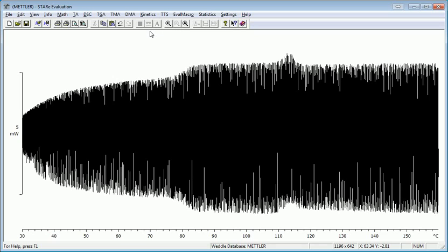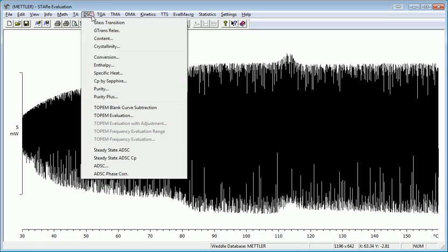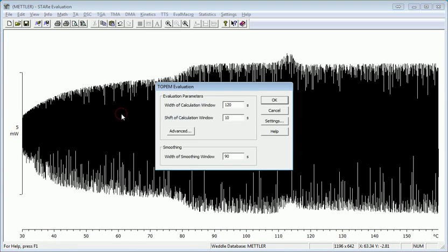To do Topham on this, or to deconvolute the Topham curve, you just choose DSC and Topham evaluation. Just accept the defaults in most cases.